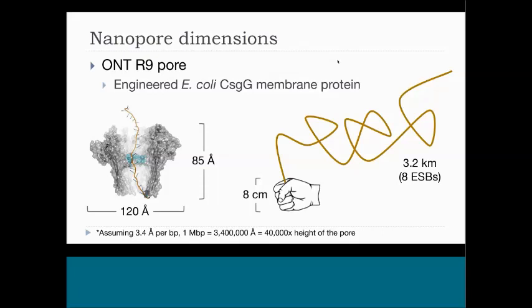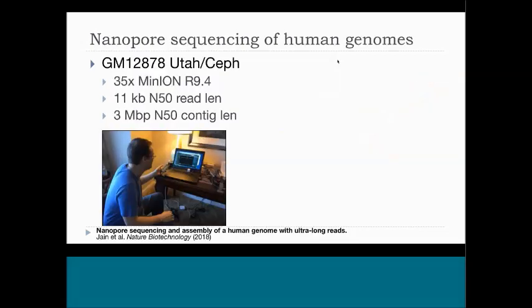If you scale that pore up to, say, the size of my fist, and then say you're going to stream through a 1 megabase pair length piece of DNA at the same dimensions, that's like threading 3 kilometers of rope, or 8 Empire State Buildings worth of rope, through your fist in the order of minutes to read the bases of that DNA. Exciting from a technology perspective, engineering perspective.